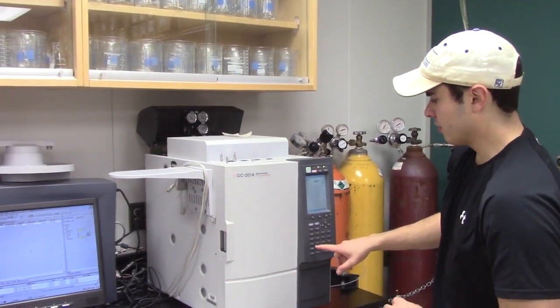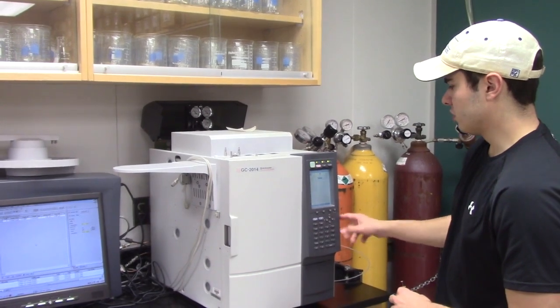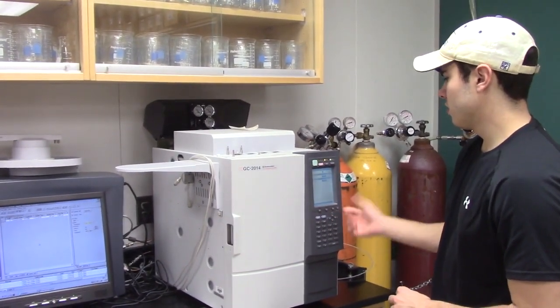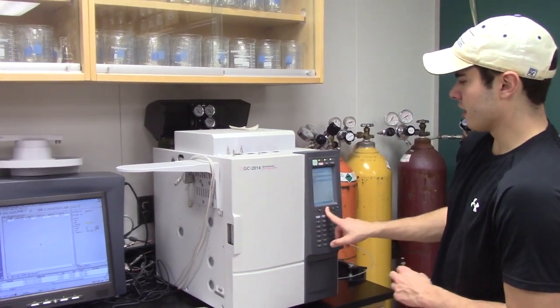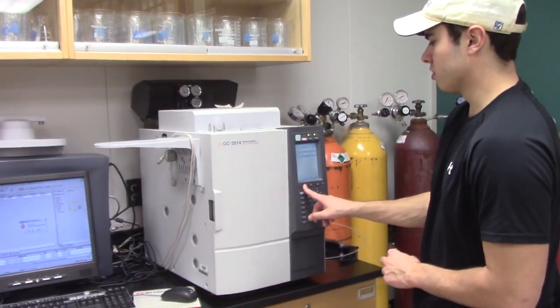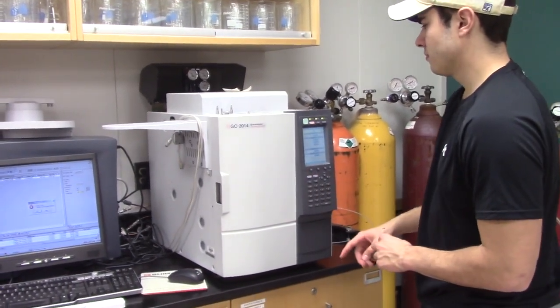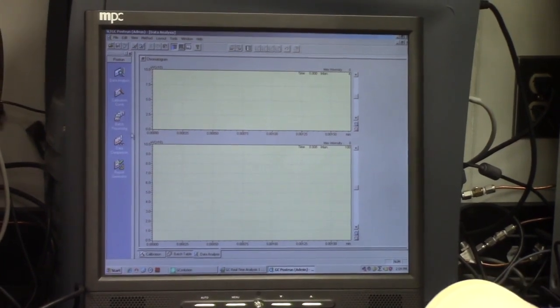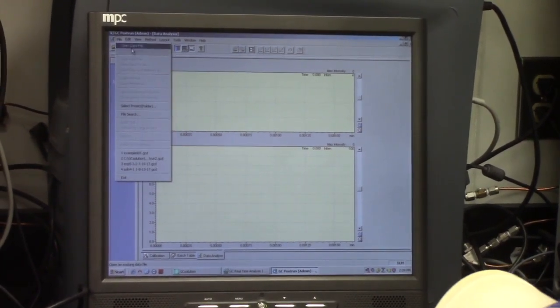And then we immediately have to go to injector and change the temperature. Just go to set. This is why you can't do it. Set line config, and then we're going to go to line 1 and click enter, and then click return. And now your sample is running. After the experiment is completed, it'll come up to a file like this.